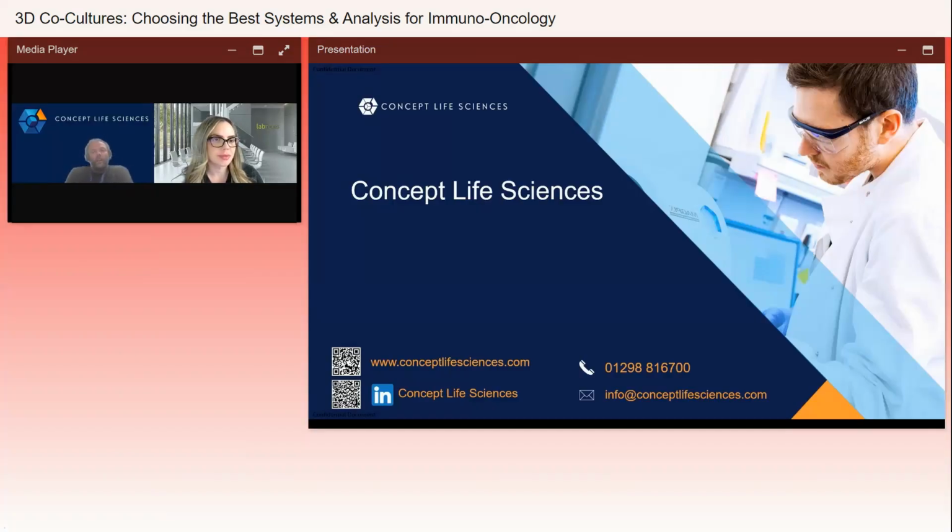So 3D, I think, is more useful if you're trying to ask questions about whether cells can penetrate into a system. Certainly that seems to be something that we've got questions around. One of the things we had questions about is using certain modes of action, like looking at anti-PD-1 treatments. When we did that in 2D, we got zero response. You could put the anti-PD-1 in, and we think part of that might be timing issues. If you're just looking at general activation, then 2D works absolutely fine. It works really well. And one of the things some people look at is what CAR Ts do in this situation. Obviously, one of the big questions about CAR Ts is whether or not they can penetrate in and get to where they need to be. So a 3D setting is a bit more important for those.